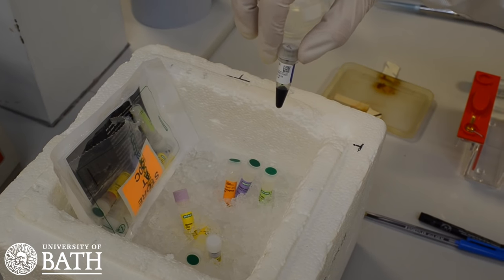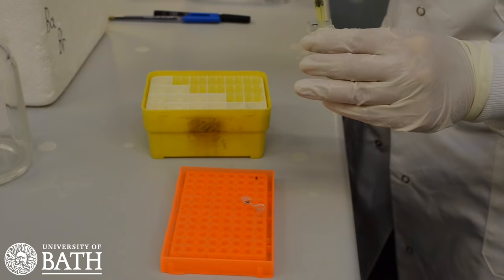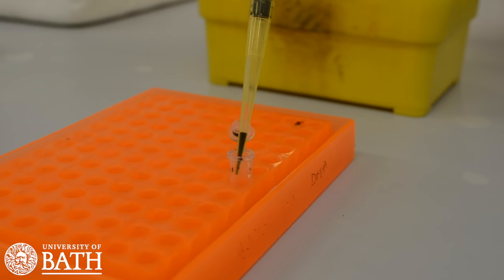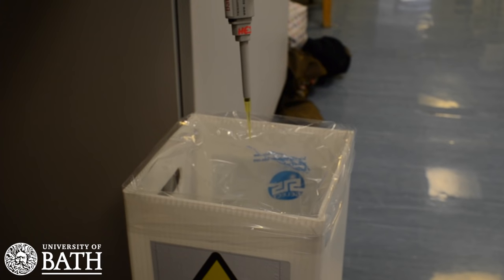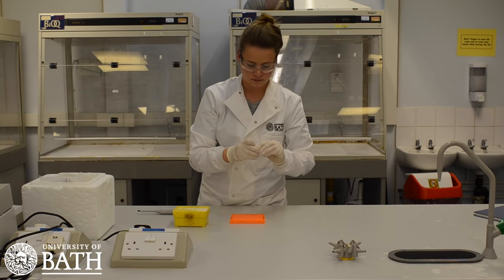Take the loading dye from the icebox. Add 10 microliters of the loading dye to your PCR tube that contains your DNA. Discard the pipette tip and then gently mix the contents of the PCR tube.